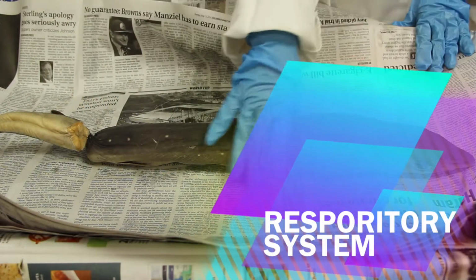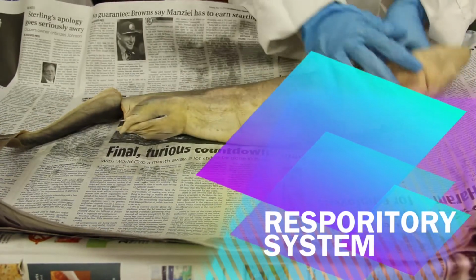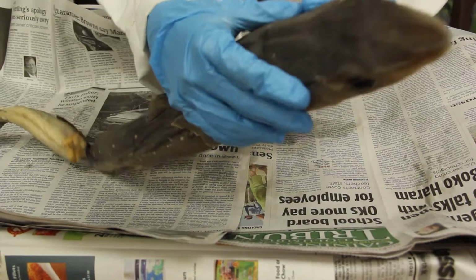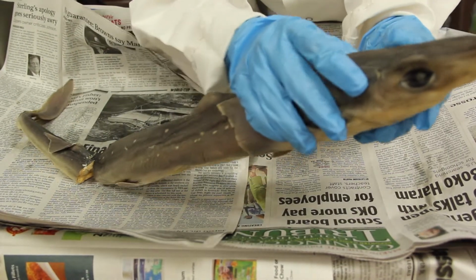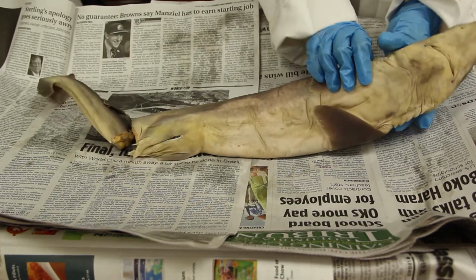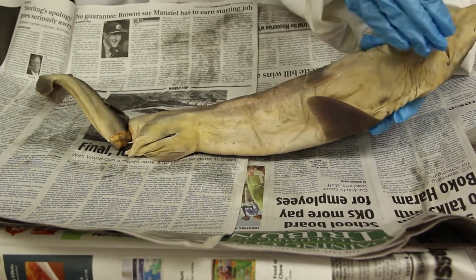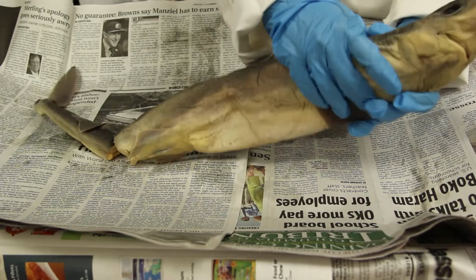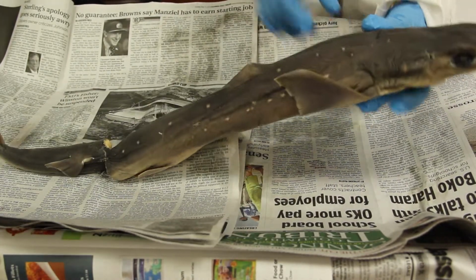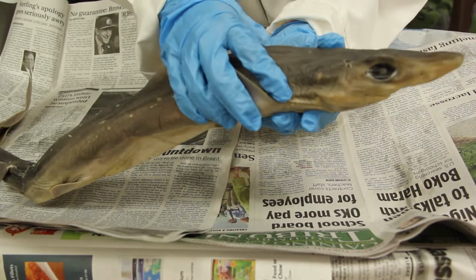So as Emily was saying, we have the mouth here, and then we have the spiracles over here, which are these two little holes right above the eyes. And so how the shark breathes is water enters through the mouth and these spiracles into gill chambers, which exit through these external gill slits right here.